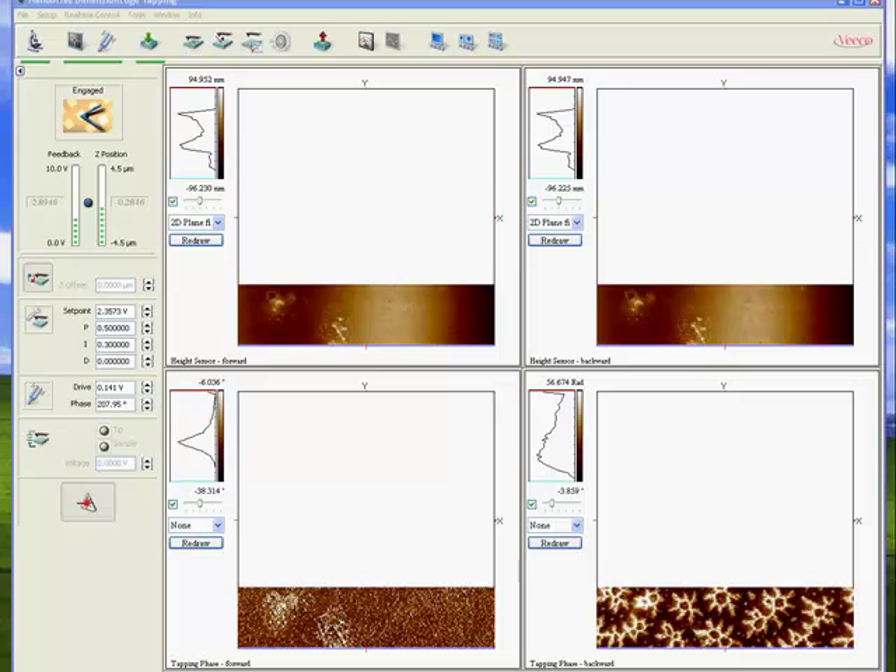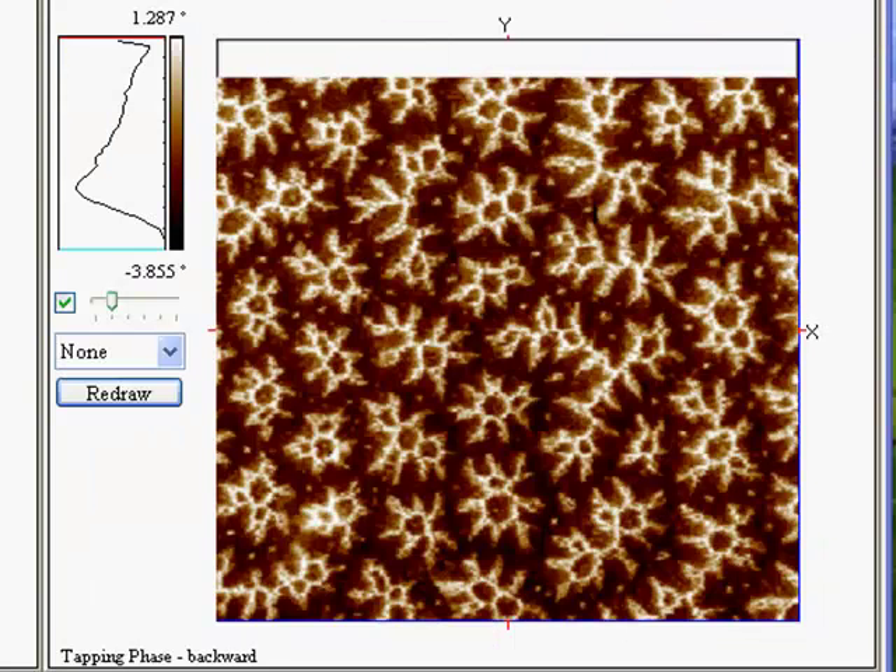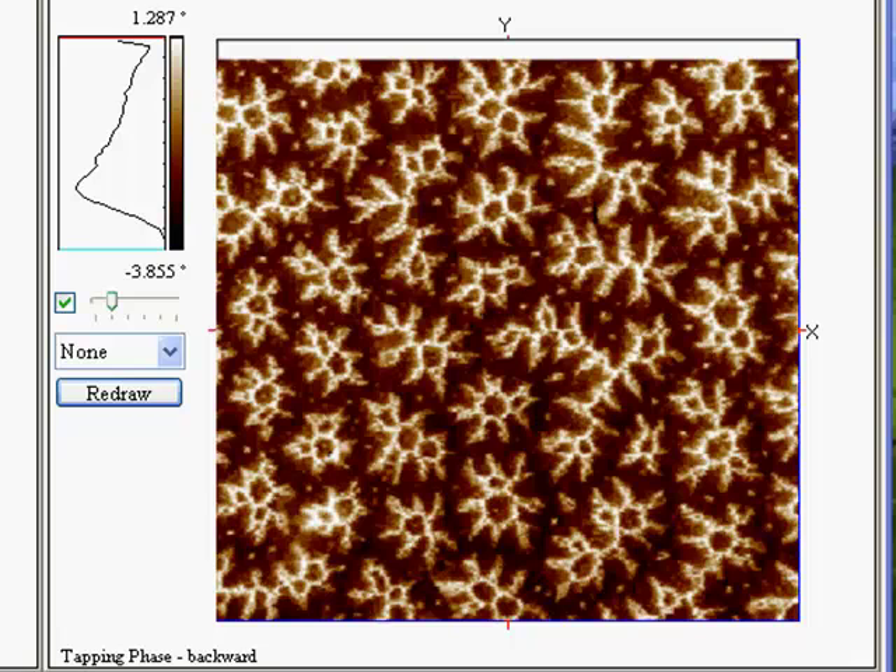Okay, now let's jump ahead — we are almost finished. Here we see the magnetic pattern in our sample, just a couple more lines to finish. This is the first image right after going into feedback; we don't have to wait for anything to stabilize. The system is very stable with a very low drift.